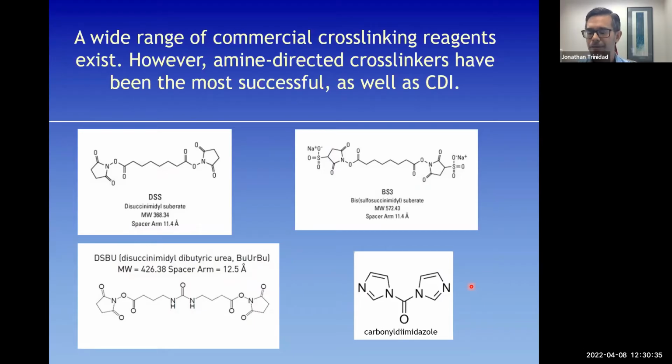So if you look at chemical catalogs, there are a lot of different cross-linkers out there. In our experience, NHS esters are the most robust chemistry. So an NHS ester would be this N-hydroxysuccinimidyl ester, and you would get a bifunctional cross-linker with two NHS esters on either end. And then maybe you throw in some small molecules to make it a little more water soluble. Here's an example that I think has recently come out. We've had some good data with this, cross-linkers that are able to be fragmented in the mass spectrometer.